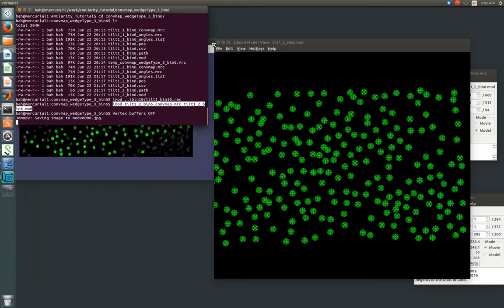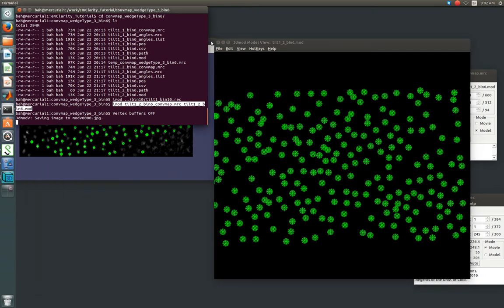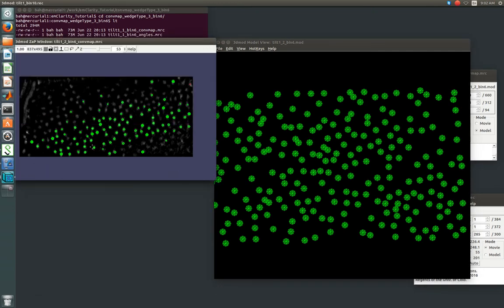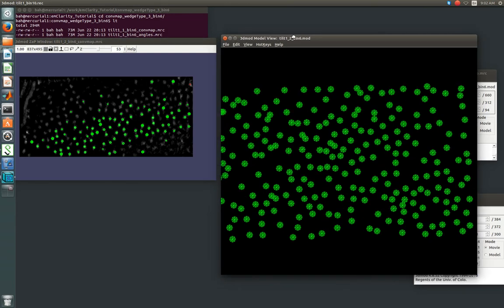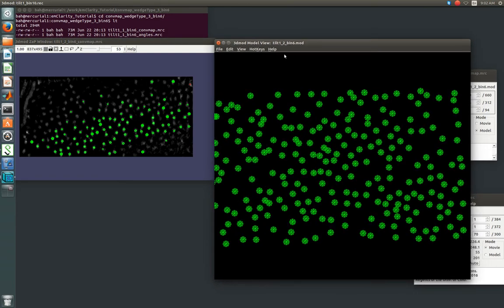In order to edit our model file, we changed first the line width and sphere size to make the lines pop up a little bit better. In this view, by selecting shift and O to open up the object menu. And you can also edit the dialog, or edit the background using shift B for the background dialog. We ran into a funny issue where we needed to turn off the vertex buffers with ctrl shift V.